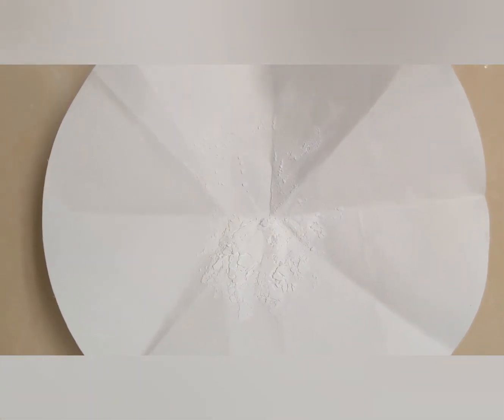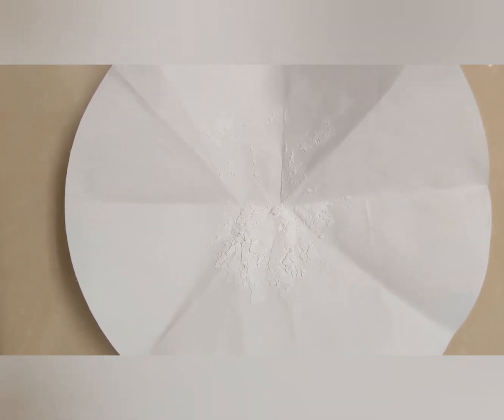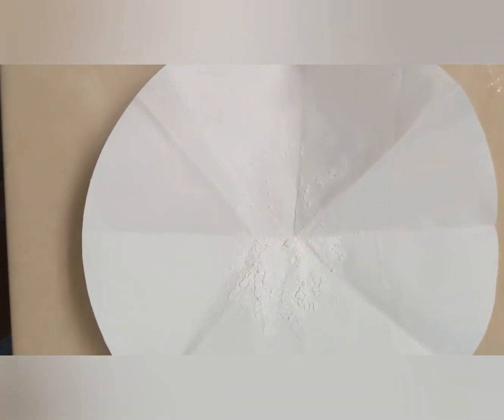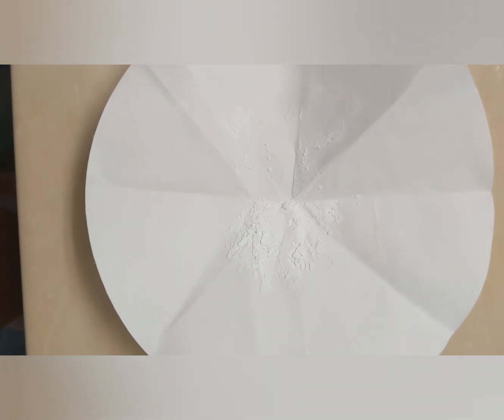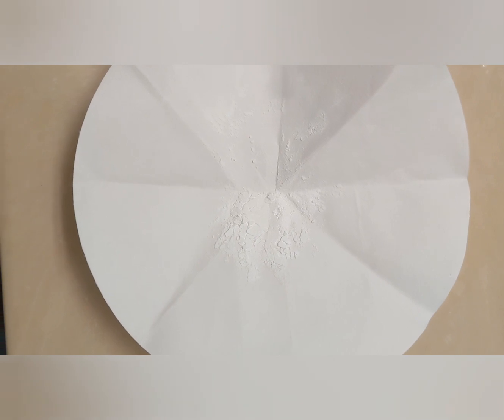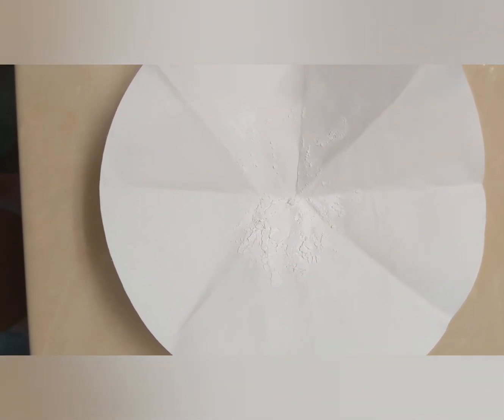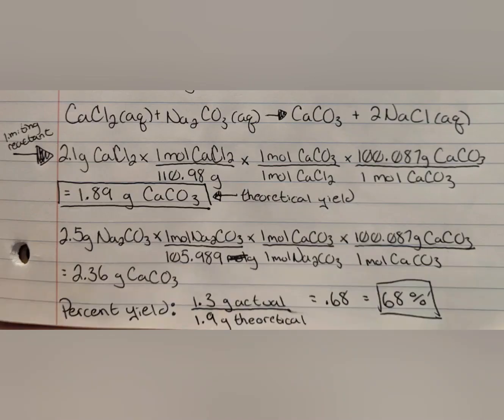Here's the fully dried end product. After conducting 4 different weighing tests, I've concluded that the filter paper and the precipitate both together weigh 3.4 grams. So now I will add that to my lab notes and begin the analysis.